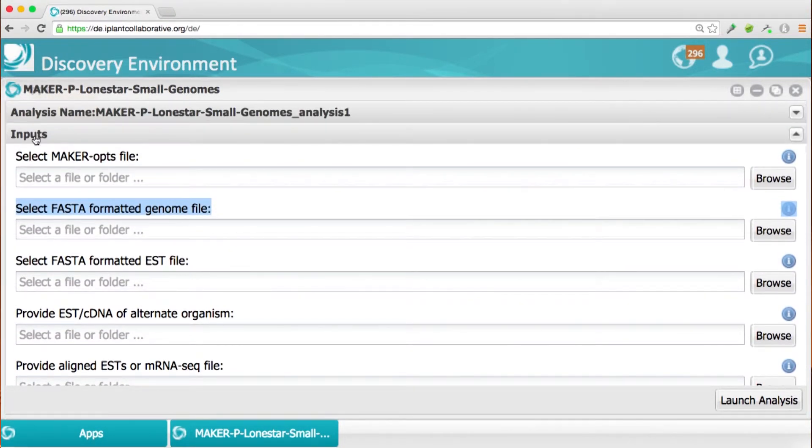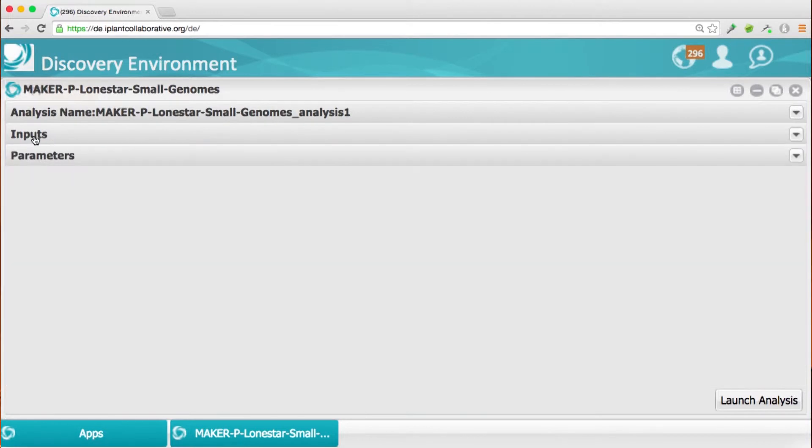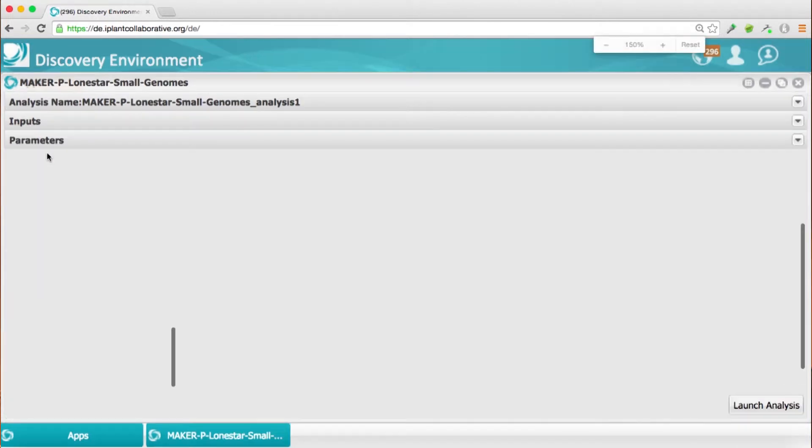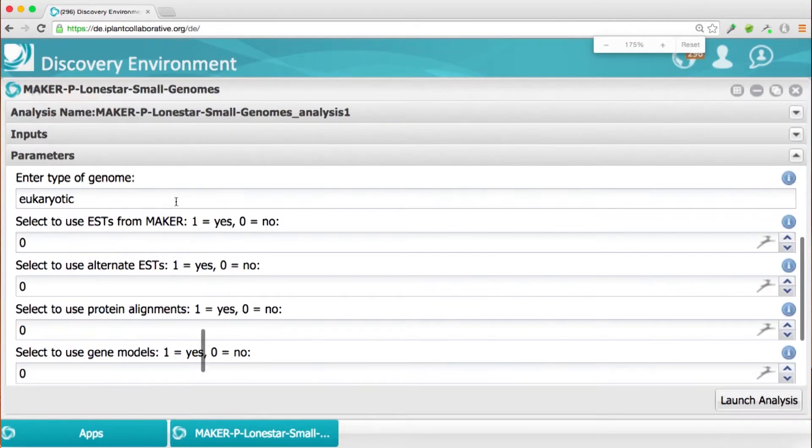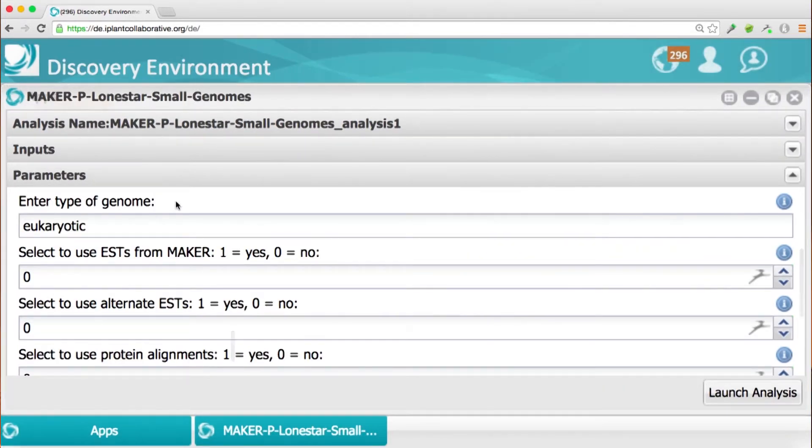But when you click on the parameters file, you'll see the whole bunch of options that need to be defined within MAKER Ops file. So if you don't want to go through and enter a number on each one, you can just upload a MAKER Ops file that you created.